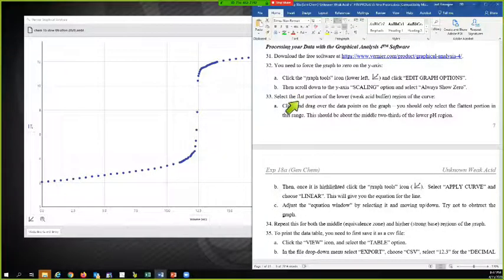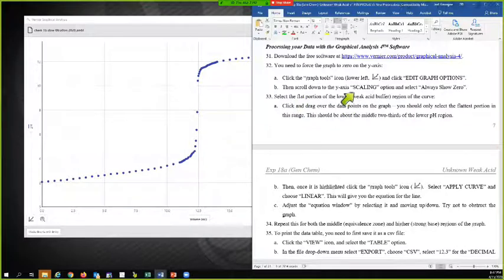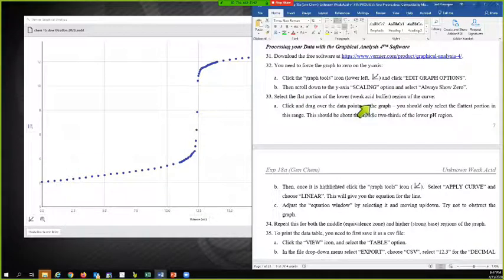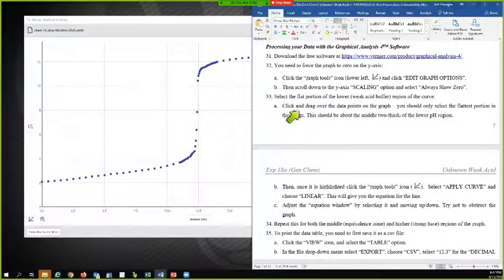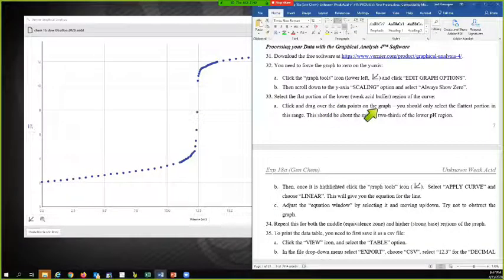Select the flat portion of the lower region of the curve. This is the weak acid buffer. And I'm going to click and drag over the data points on the graph. I want to get the flattest part.